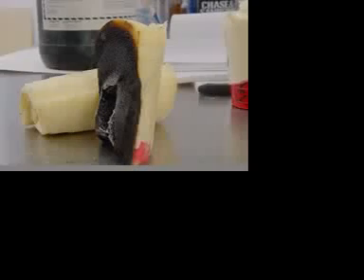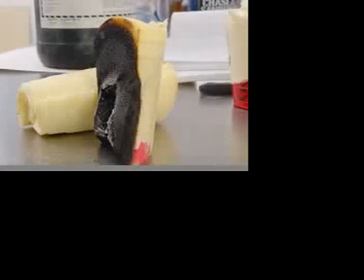As you can see, no sustained combustion was evident. This is what the sample looked like after 10 minutes, and you can see the significant amount of char.